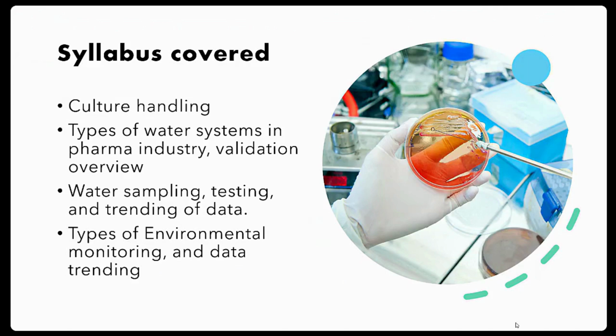Alert and action levels will be calculated based on the trending data. By seeing the trend data, we can come to know whether consistency is being maintained in the facility or not. We'll check either for water or for environmental data.